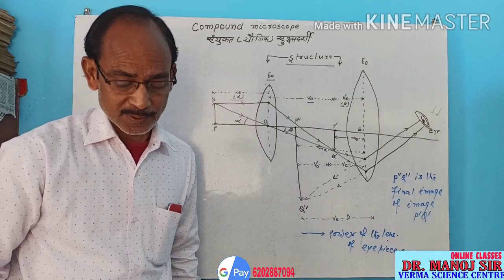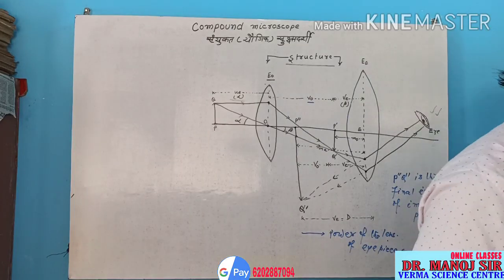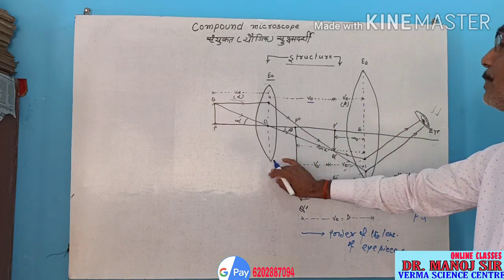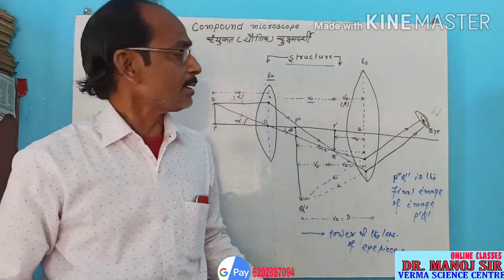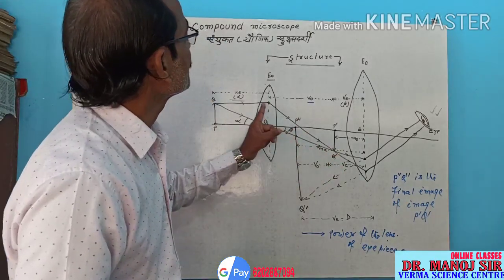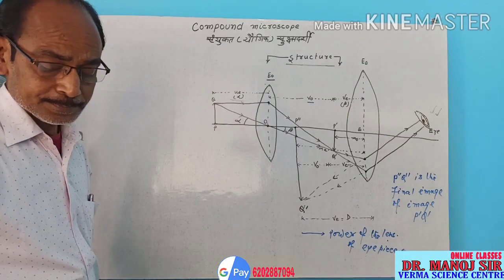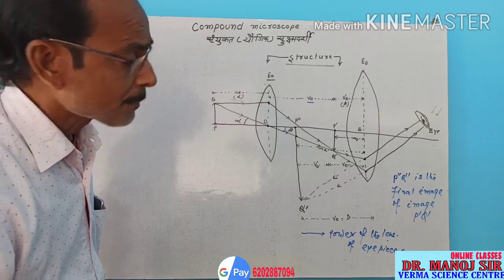We have now study about, due to less aperture of the objective piece and the eyepiece, we have get a minimum angle. We have get a minimum and least angle from both the lenses. So therefore we come to the magnification power of the compound microscope.